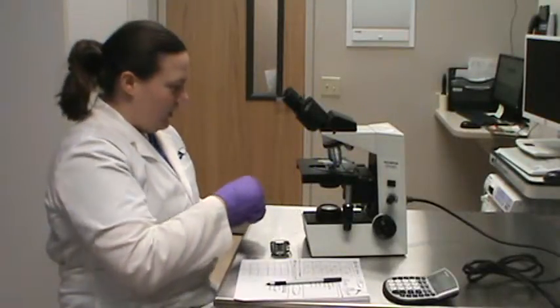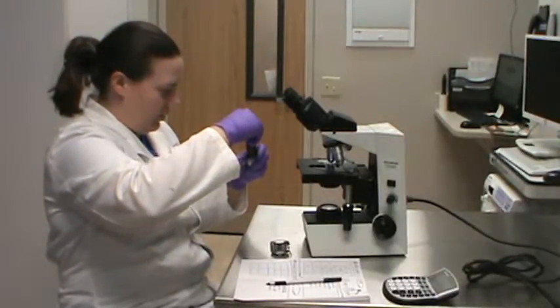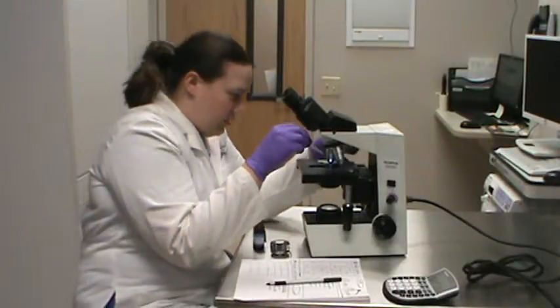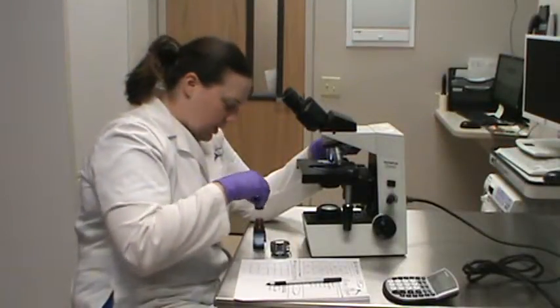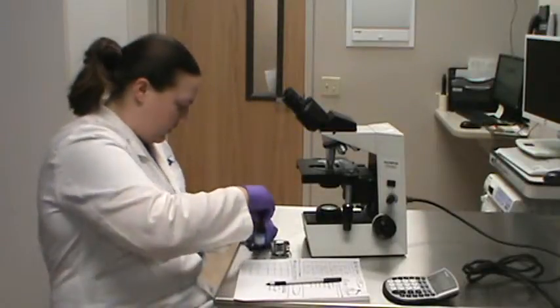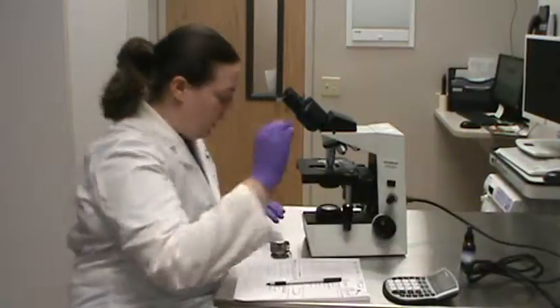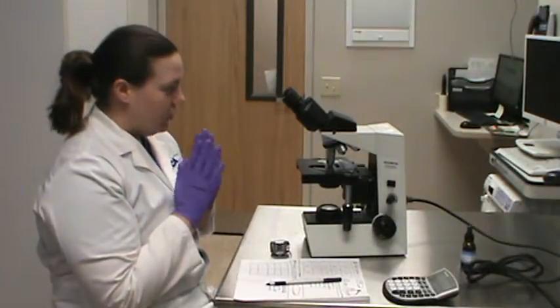We're going to use our pipette to place 1 drop of the immersion oil onto our slide. Alright, so that's 1 drop. Then we're going to switch it over to the 100 times lens. We're just going to close this and put it to the side because we're done with it for right now.